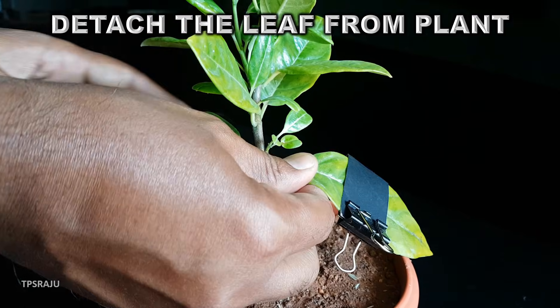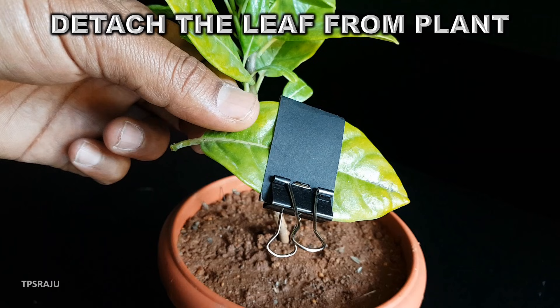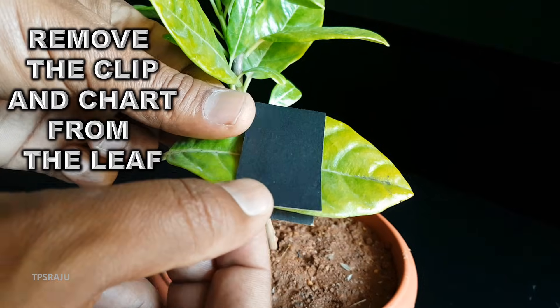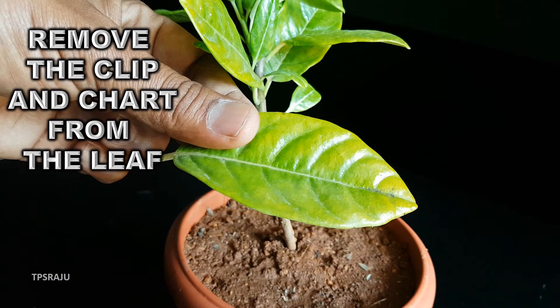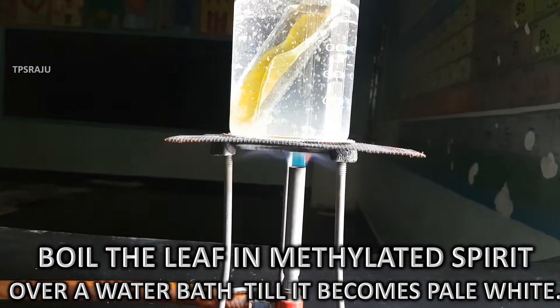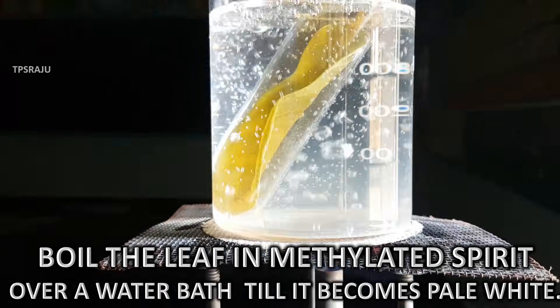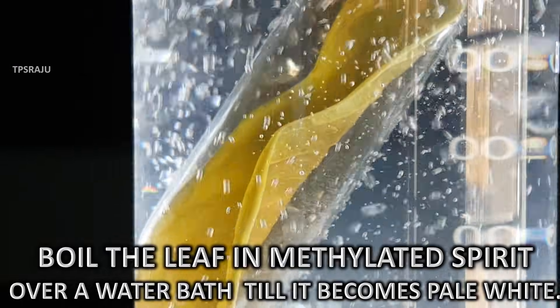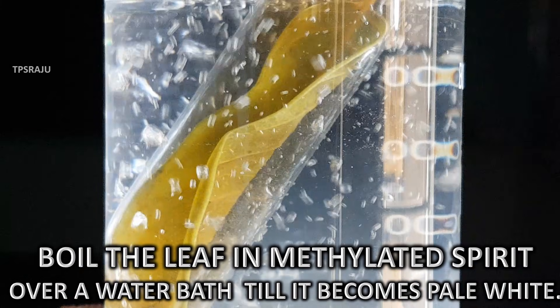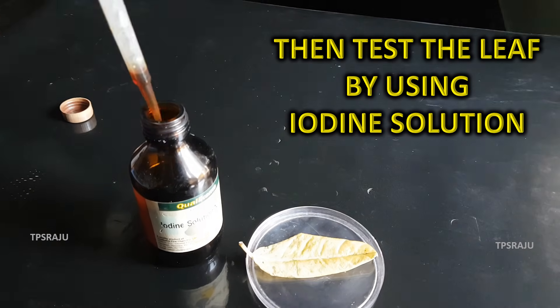Detach the leaf from the plant. Remove the clip and cloth from the leaf. Boil the leaf in methylated spirit over a water bath till it becomes pale white. Then test the leaf by using iodine solution.